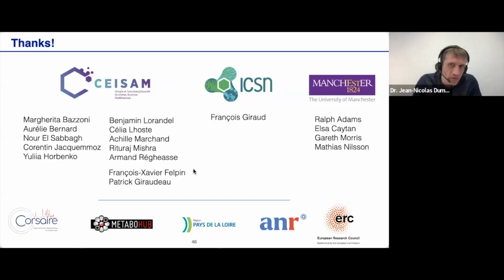Usually what we do is that there's the main task that we're trying to achieve, which is some sort of spatial parallelization, or diffusion encoding, and we try to choose the best possible axis for that, which can be Z or transverse, depending on the application. And then for coherence selection, we use an orthogonal axis. So if we do diffusion encoding along Z, we'll be doing CTP selection along X, and the reverse. Same for pure shift NMR.